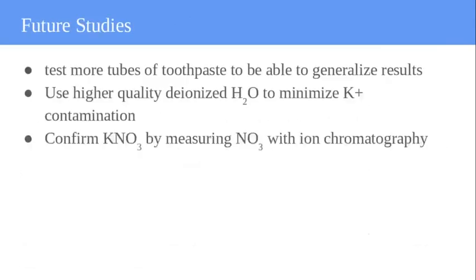For future studies, I would suggest to test more tubes of toothpaste to be able to generalize results, use higher quality deionized water to minimize potassium contamination, and confirm potassium nitrate by measuring nitrate with ion chromatography.